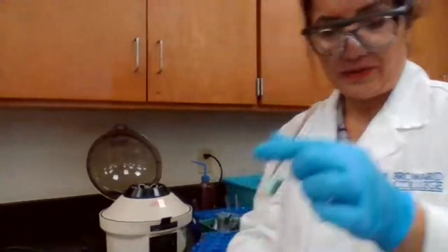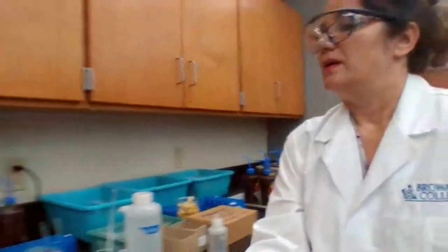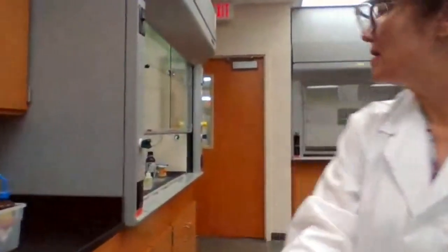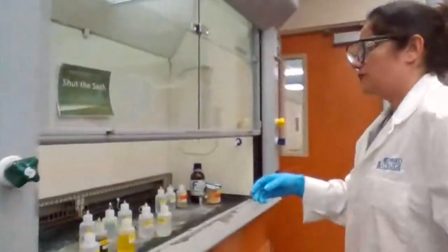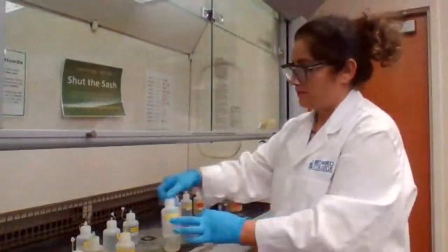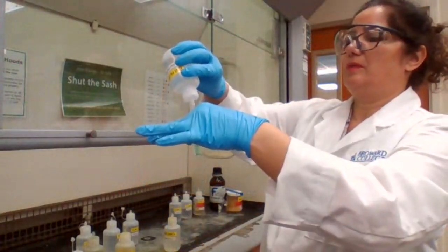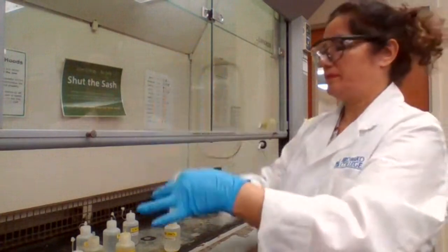We add 3 molar sulfuric acid. If there is lead, lead sulfate is going to form. So we add 3 drops: 1, 2, and 3.